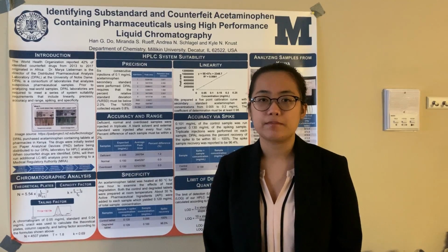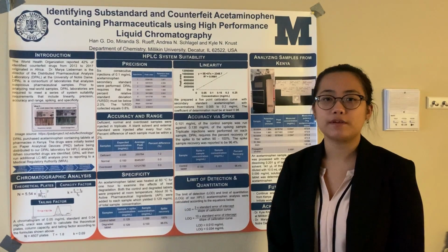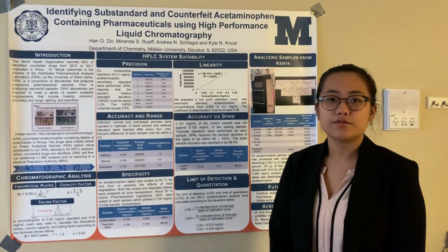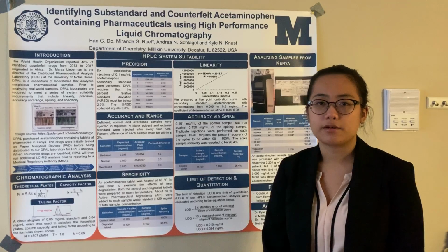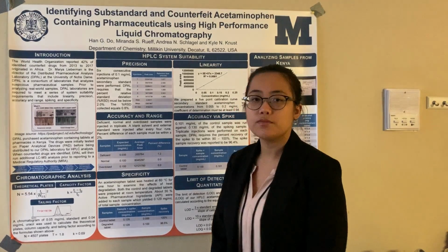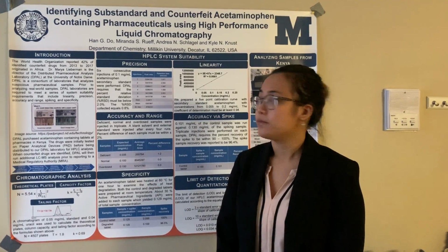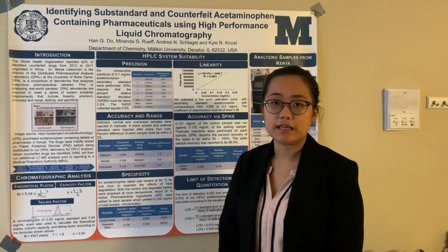Today I present my project about identifying substandard and counterfeit acetaminophen-containing tablets using high-performance liquid chromatography. The World Health Organization reported that 42% of counterfeit drugs originated from Africa from 2013 to 2017.